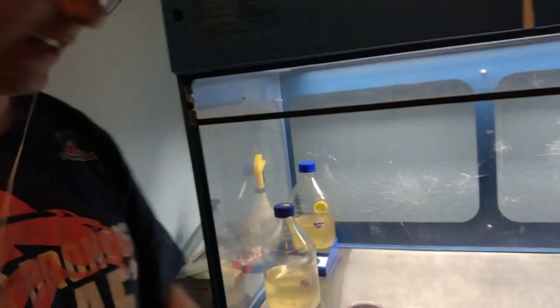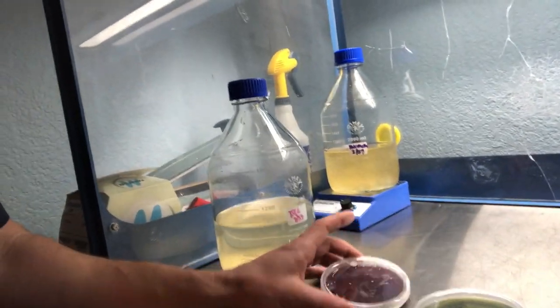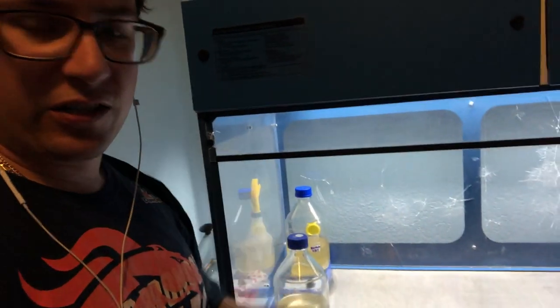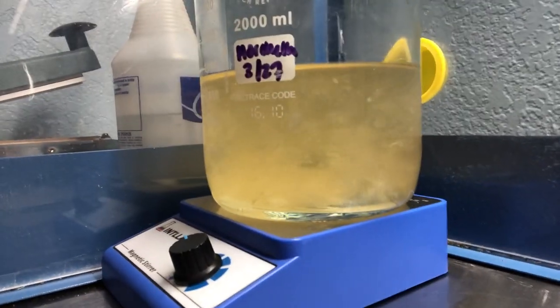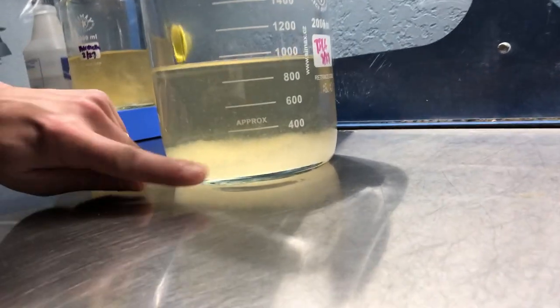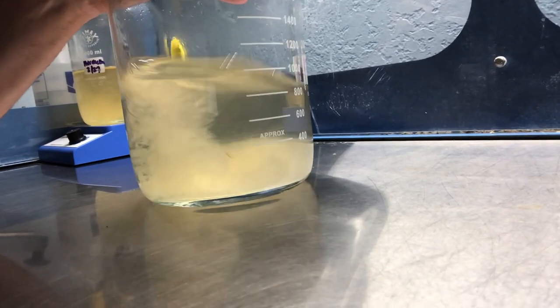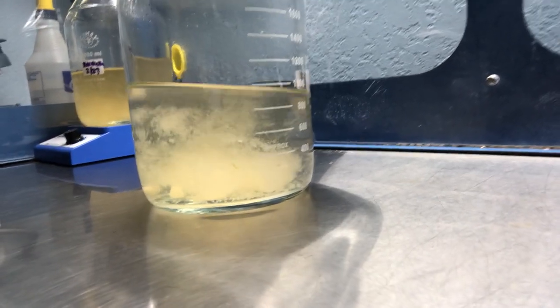All right, what's up guys? So it's 3 days into after I took the sampling of these cordyceps, and surprisingly I found some bacteria. So that's why it's important to QC your liquid cultures. You can see the graininess. Here's the Morchella that's growing. See how the top, you can still see it's kind of clear. And then if you come over to the cordyceps culture, it's a little clear, but you can see down low, this is really granular. It doesn't look like healthy mycelium, and it kind of plumes around when you shake it up. So that's a good indication that there's some bacteria.